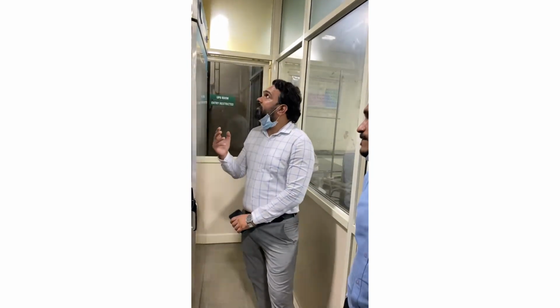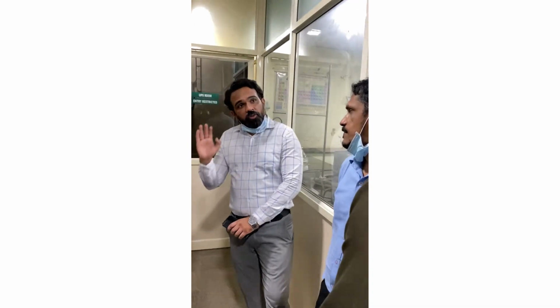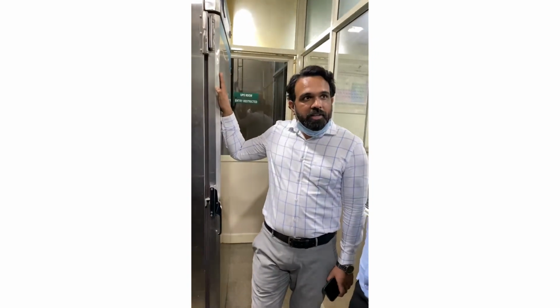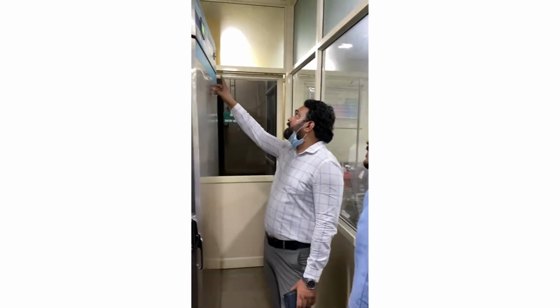One is the real time. Real time means if the shelf life is 1 year, we will have samples from the day of manufacturing up to the final expiry date. Then there are the accelerated studies. Real time is at 25 degree ambient temperature and 60% RH, plus minus 5 degree. In accelerated, humidity would be high and temperature would be 40 degrees centigrade. It is called accelerated shelf life studies.